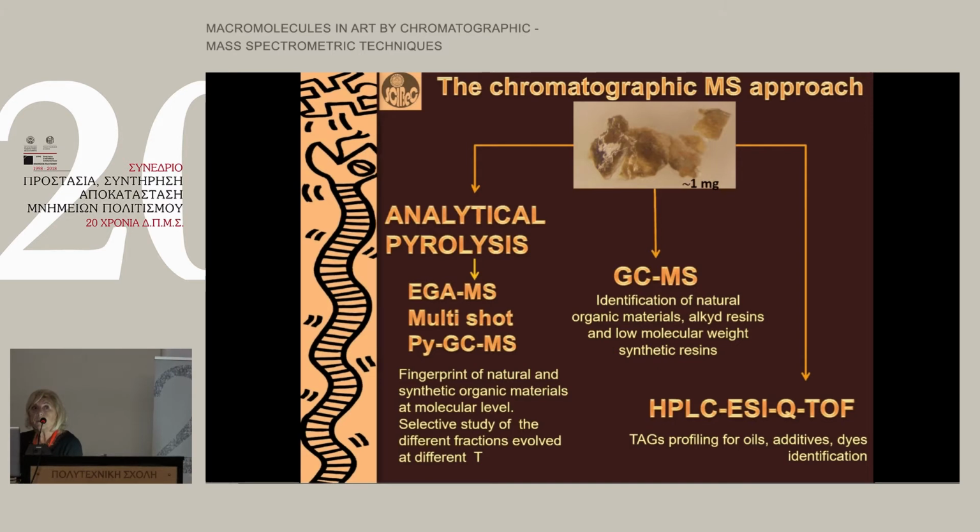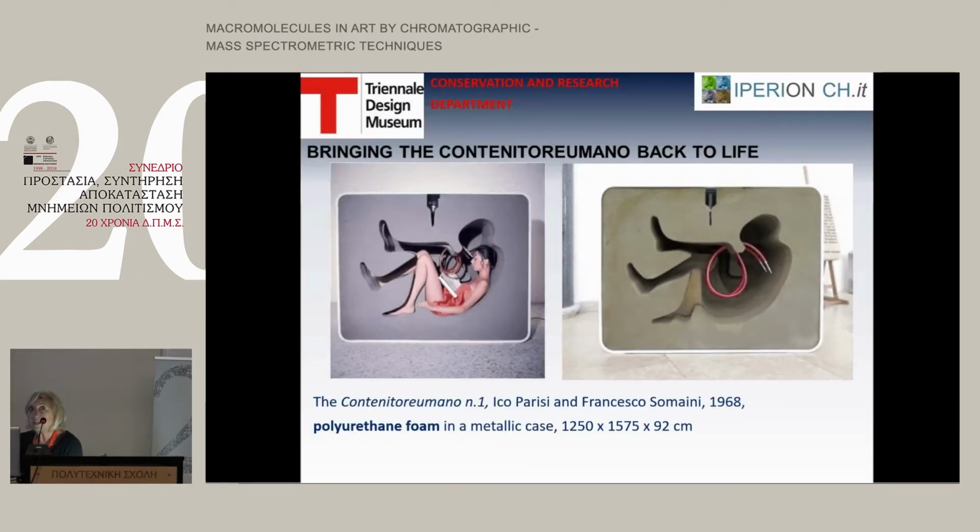But if you wanted to understand the presence of dyes, as it was shown this morning for purple analysis, you have to use HPLC MS analysis. So I shall have some example for all of that. And first I start with contemporary art.